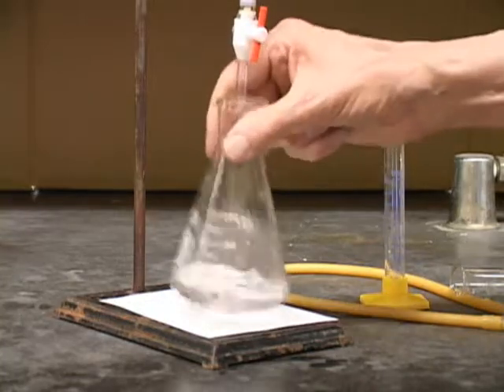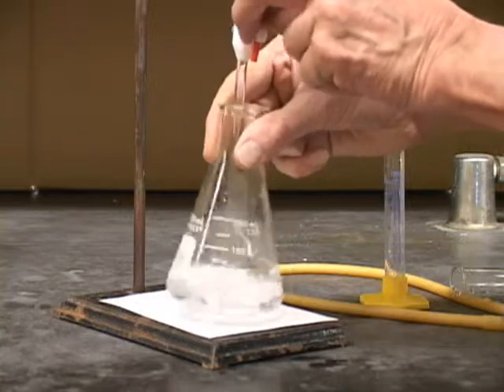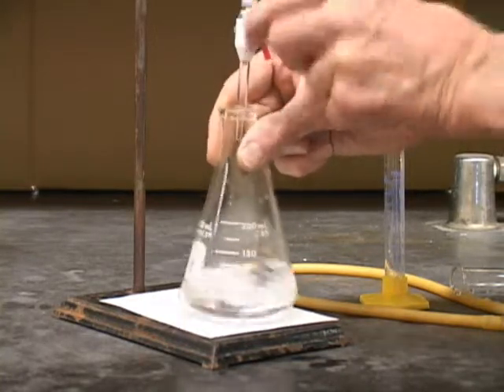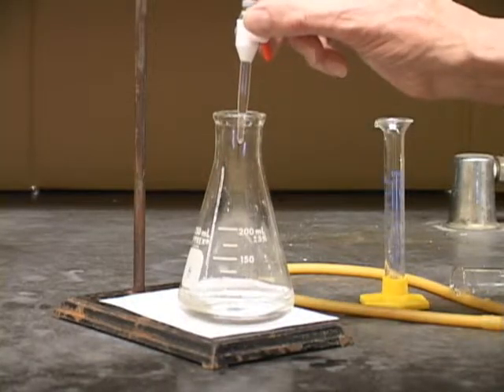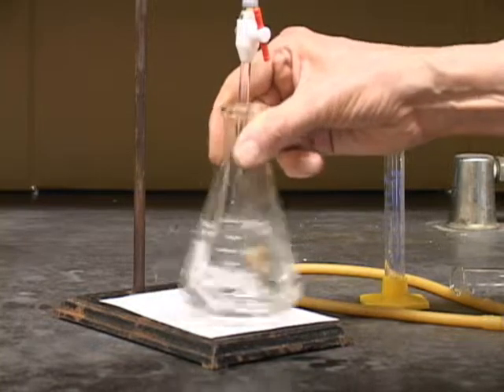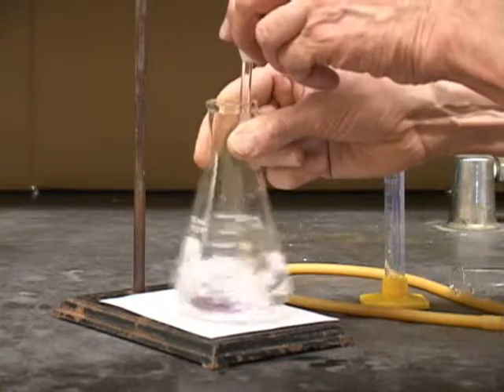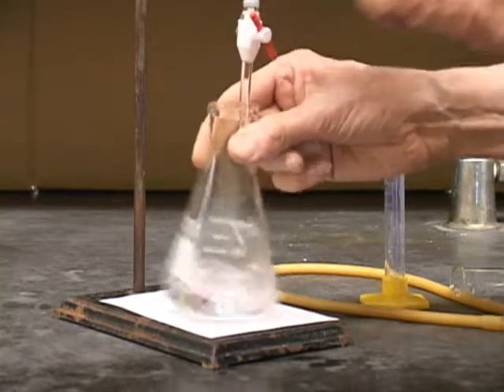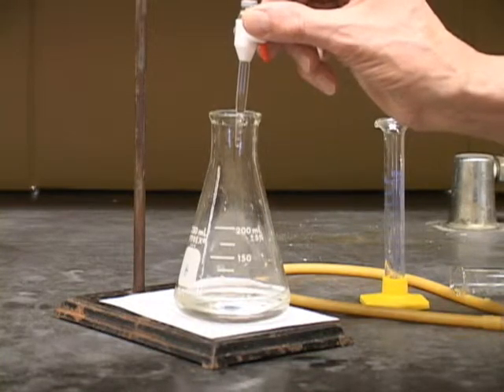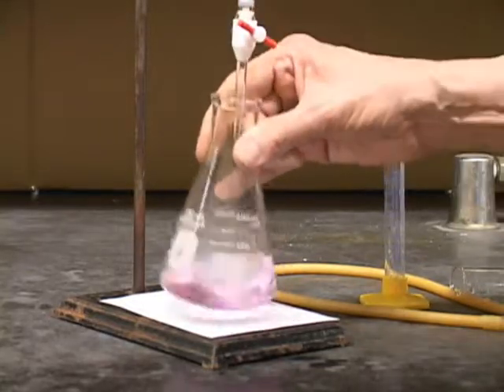You can add the sodium hydroxide fast at first, but keep stirring. When the red spot gets bigger, slow the titration to a dropwise addition. Now, slow it down even more. Add the last drop. That's the end.